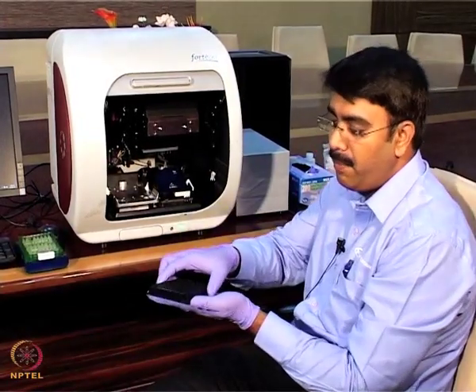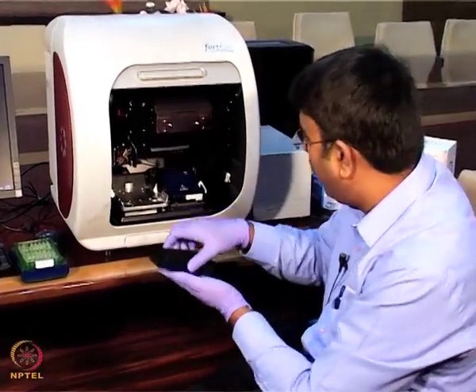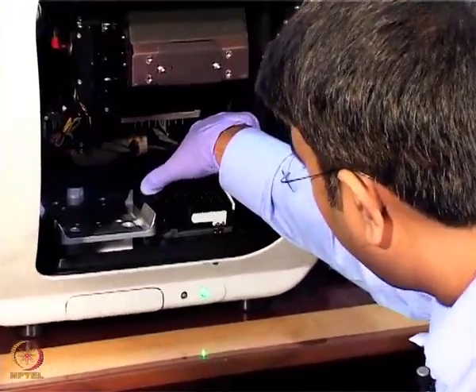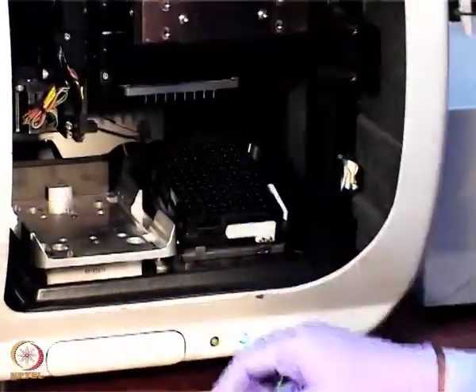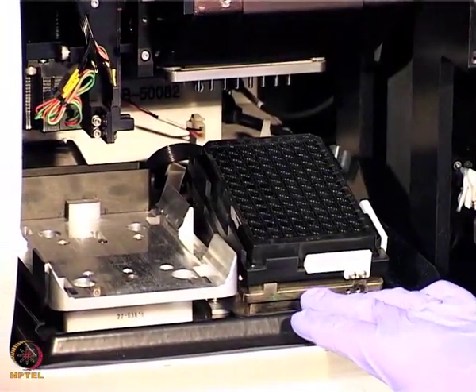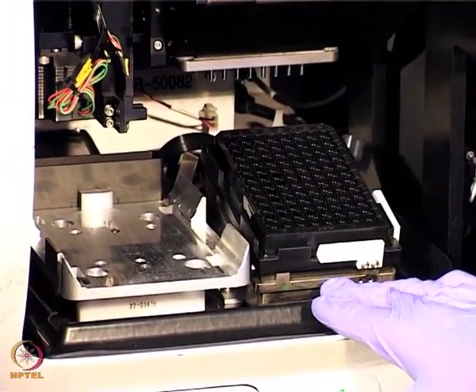This is the sample plate, a 96 well plate. I am going to place it in the sample compartment here like this. There is a click sound, it goes in firmly and fits into the sample compartment. If you look at the sample compartment, it works on dip and read. The BLI technology works on the dip and read method.